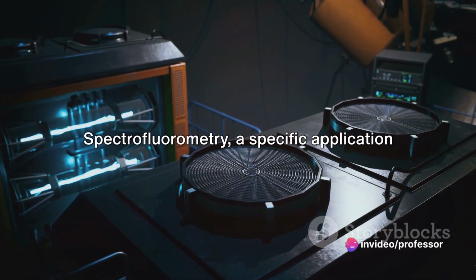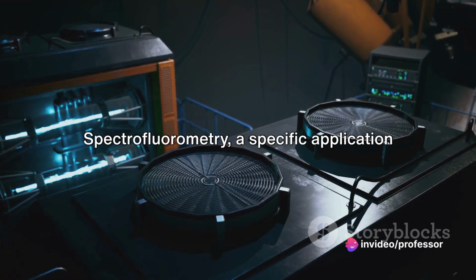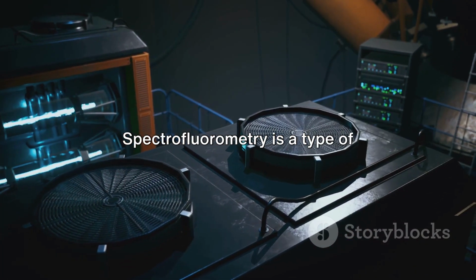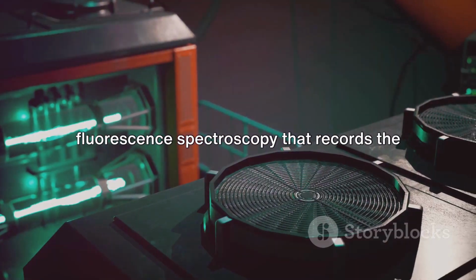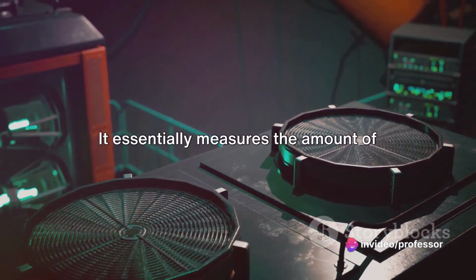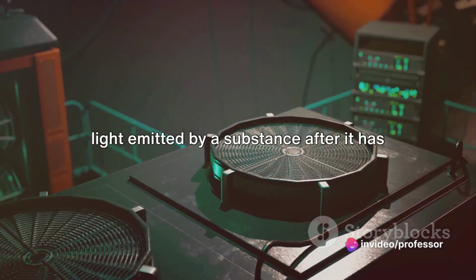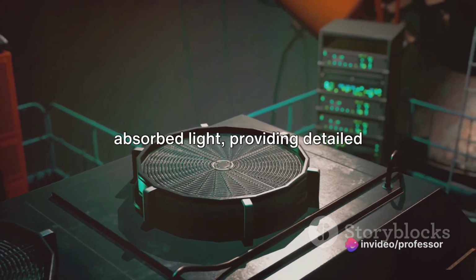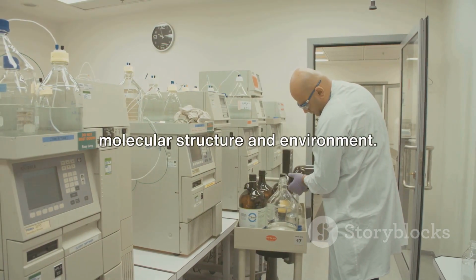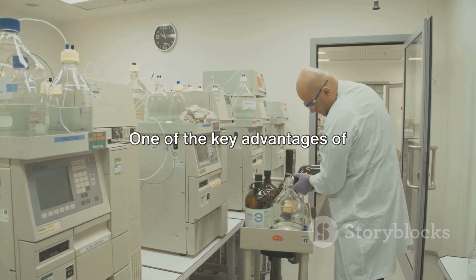Now let's delve into spectrofluorometry, a specific application of fluorimetry. Spectrofluorometry is a type of fluorescence spectroscopy that records the intensity of fluorescence as a function of wavelength. It essentially measures the amount of light emitted by a substance after it has absorbed light, providing detailed information about the substance's molecular structure and environment.